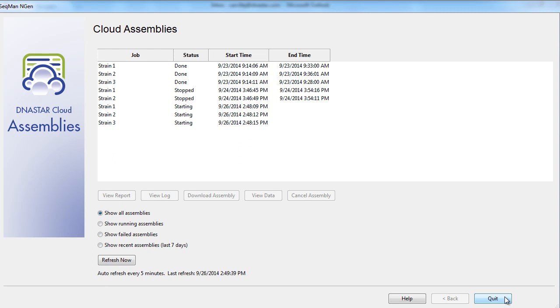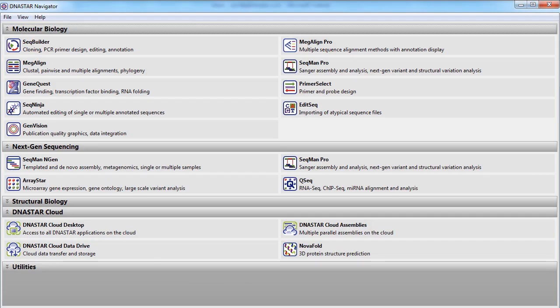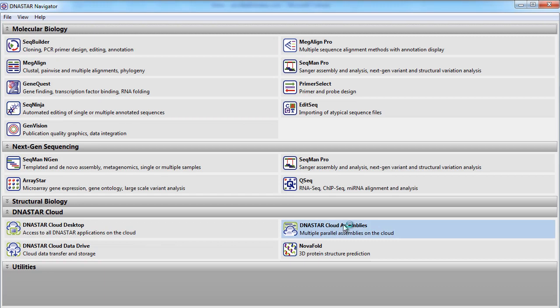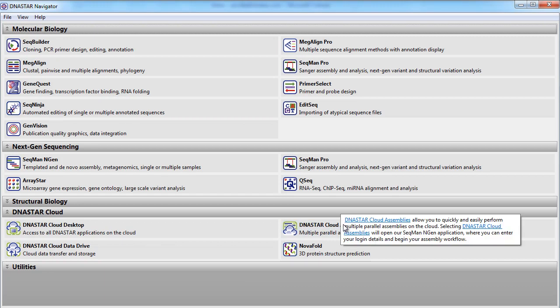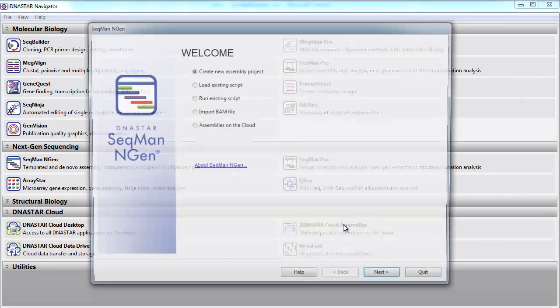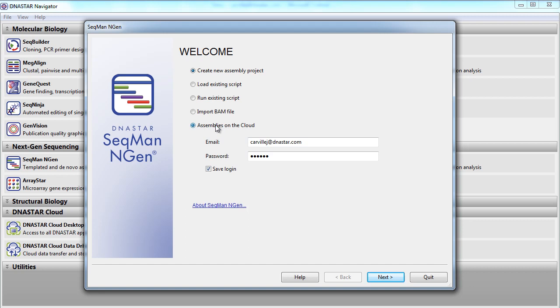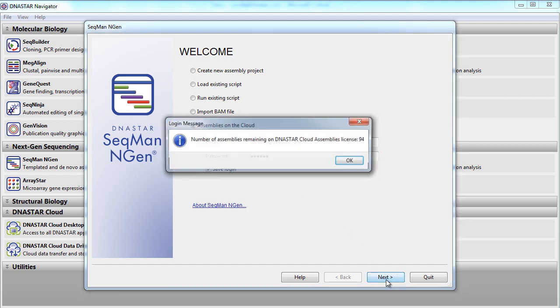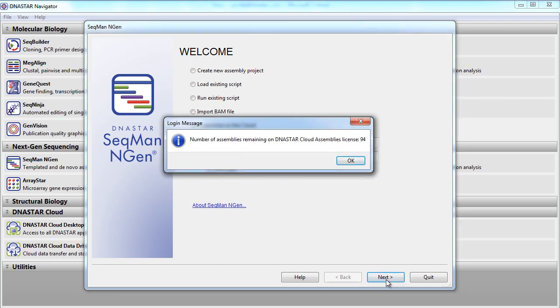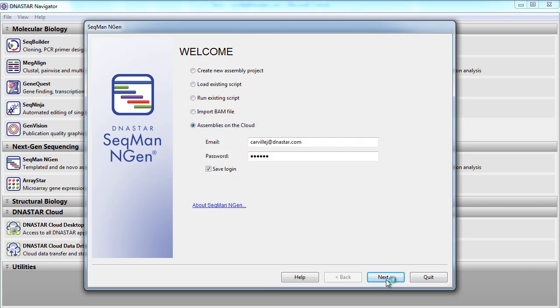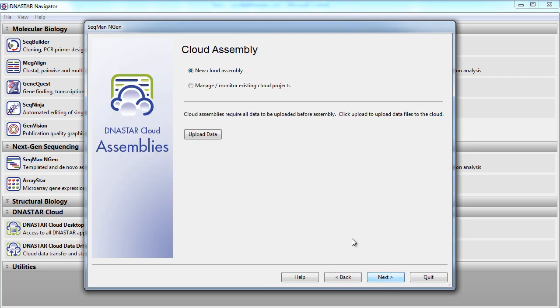If we choose to close out of this screen, we can always get back by opening up DNA Star Cloud Assemblies from the navigator, selecting Assemblies on the Cloud, and then selecting Manage Monitor existing cloud projects.